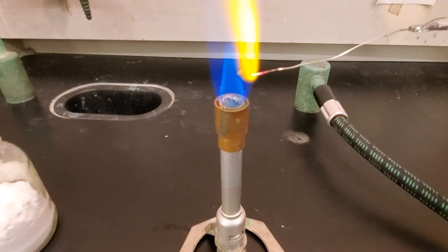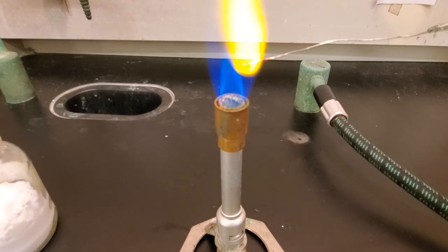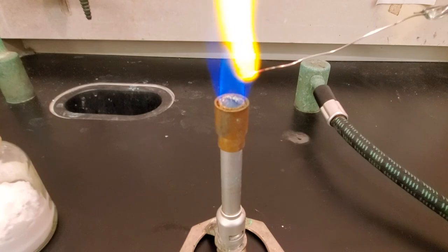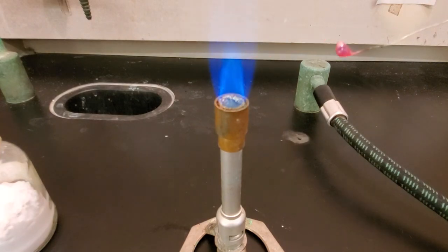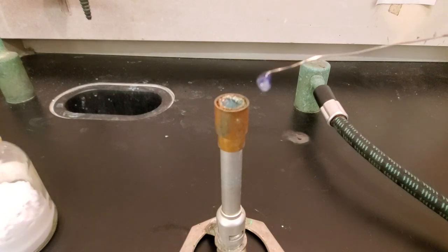After it reacts, we should see a color on there. I'm going to go ahead and pull that out. Now you'll notice it's of course red hot, but you can kind of see — there's a really good shot — you get a nice blue color with cobalt on the borax bead test. As it cools, you get that color coming in even better. You can see here that as it's cooling, it's really developing that nice blue color. And that's a positive test for cobalt.